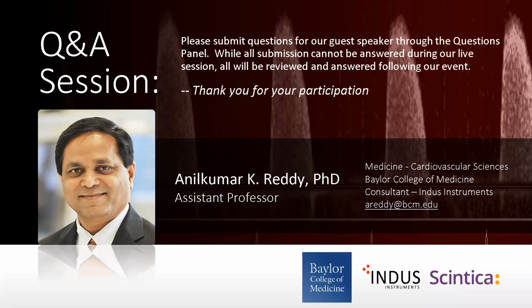That means use a 100 millisecond or 200 millisecond window rather than a 1,000 millisecond window, because a 1,000 millisecond window will have several beats and you will not be able to place your marker precisely on the acceleration part of the waveform. So yes, it can be done, but you have to be careful, especially with peak acceleration. Mean acceleration, I think you can do.